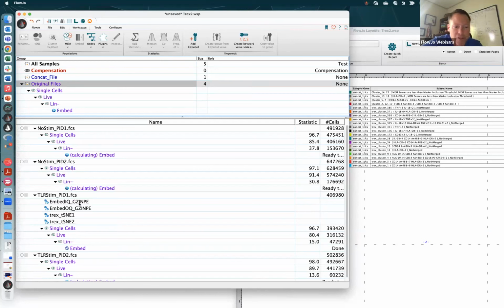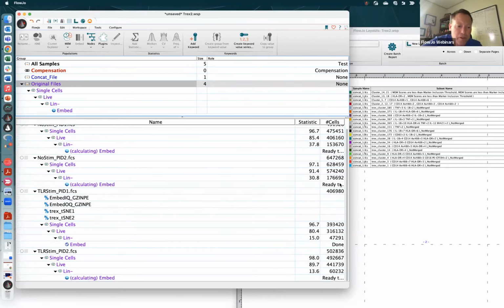So there you go. When it finishes up on a file, you see the new parameters getting produced, the input quality and the output quality. Those are the things that we will work with. And of course, the first one I picked randomly was one that I don't want to look at, patient ID 1. All right, let it finish up with patient 82, and we will move on with this demo.